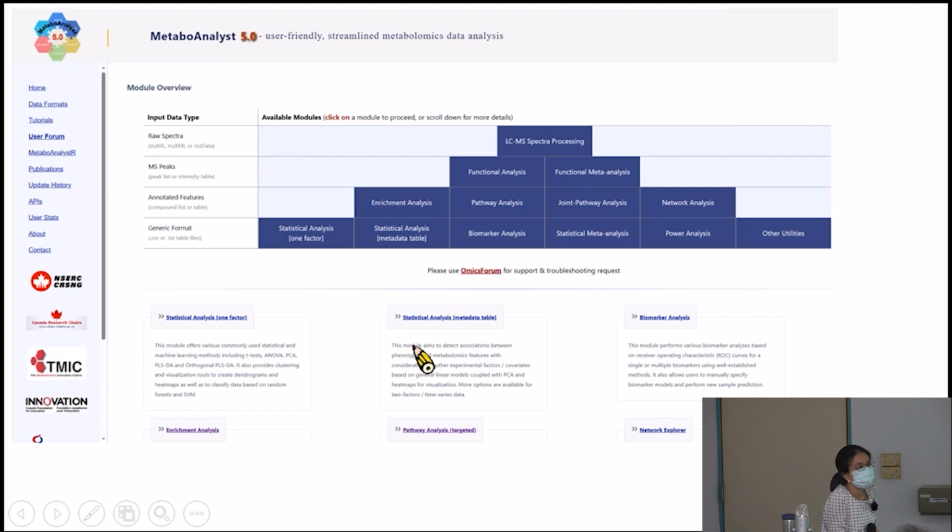How to determine whether to use gas chromatography or liquid chromatography? I think gas and liquid chromatography differ in the phase in which you first send your sample into the column. So it's just the approach for that. So I can use the same sample in two different approaches and get two different sets of data from the same sample? I think you should get one sample in one column. It's not possible that after gas separation, you also put that in another separation. That probably doesn't make sense.